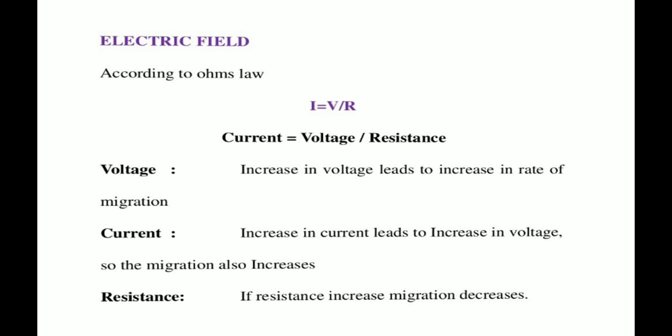So you can also say that the higher the voltage, the faster DNA will travel through the gel. So this is also a very important thing की जसं जसं तुम्ही व्होल्टेज वाढवत जाताल तसं तसं जे काही तुमचा मायग्रेशनचा रेट असेल तो सुद्धा इन्क्रीज होणार आहे.